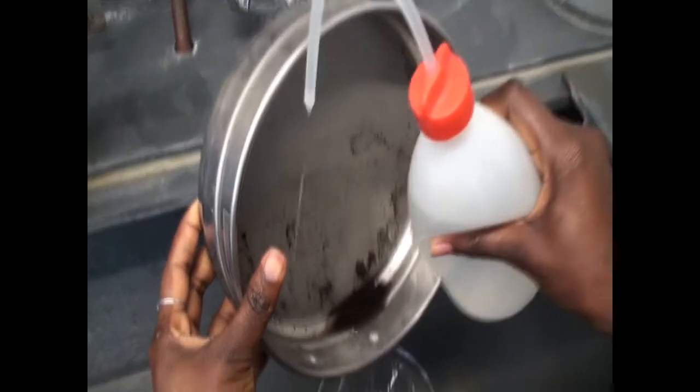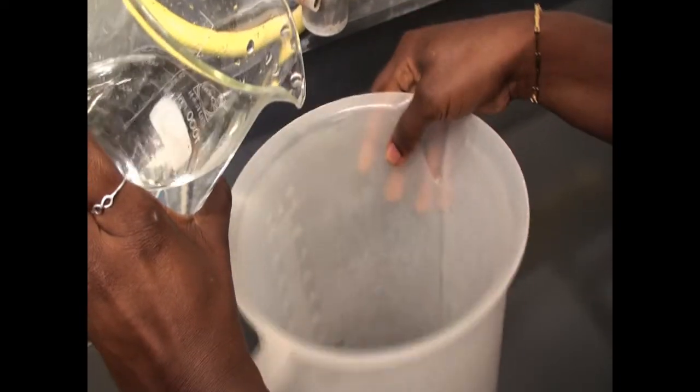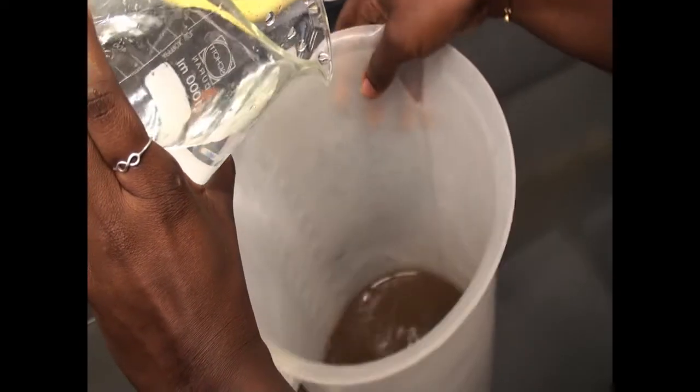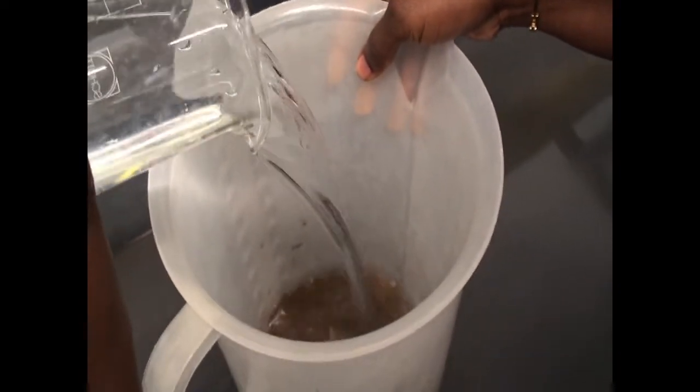Before we extract with the funnel, to ensure maximum extraction of the cysts, it's advised to add more water into the soil and repeat this procedure for at least three times.